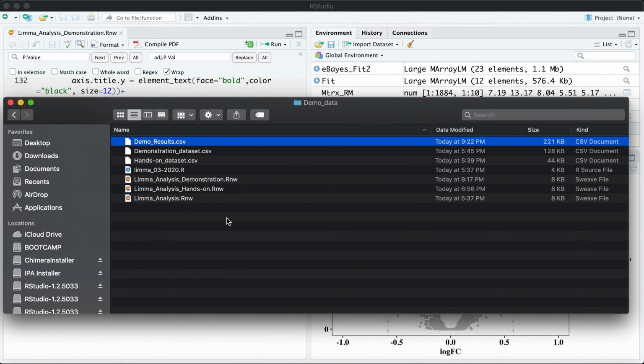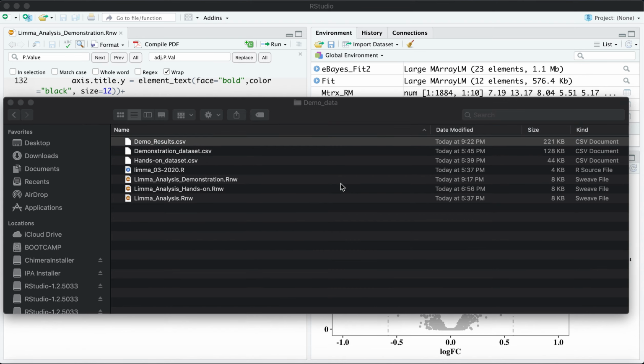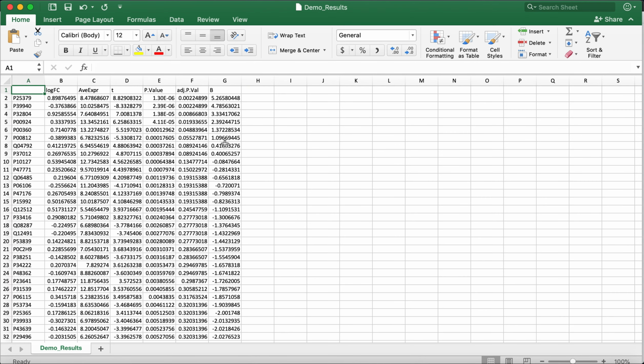We go to our folder where the results are located, and these are the results files. We're opening it in Excel. We're going to tweak this file a little bit because IPA works very well with tables, but we need to add something else. Before doing IPA, we are going to give this column again the accession column name, and with that we save it in case we cannot undo anything we did already.